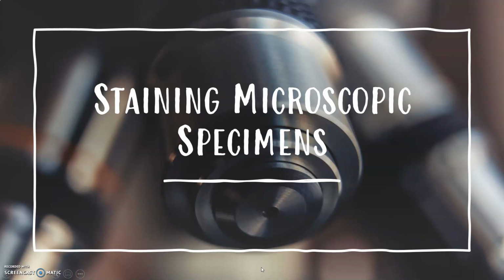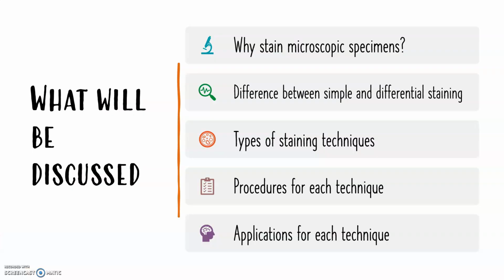Hello everyone, today we will be going over staining microscopic specimens. Throughout this presentation, I will discuss why microscopic specimens are stained, the differences between simple and differential staining, the types of staining techniques, and the procedures and applications for each of the techniques.